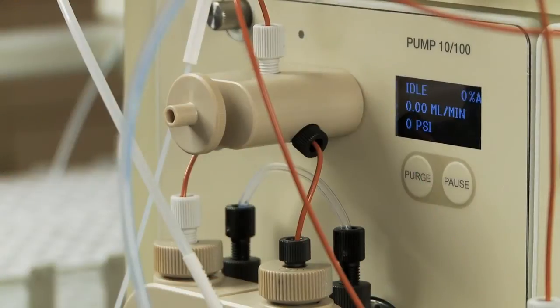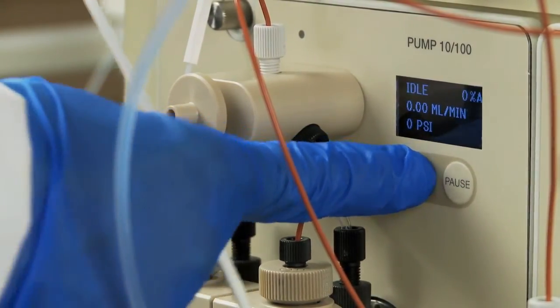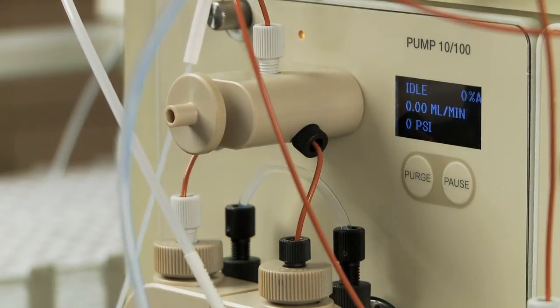To purge the system using the faceplate, use the purge buttons to start and stop the purge. Perform this procedure on each pump individually for approximately two minutes.